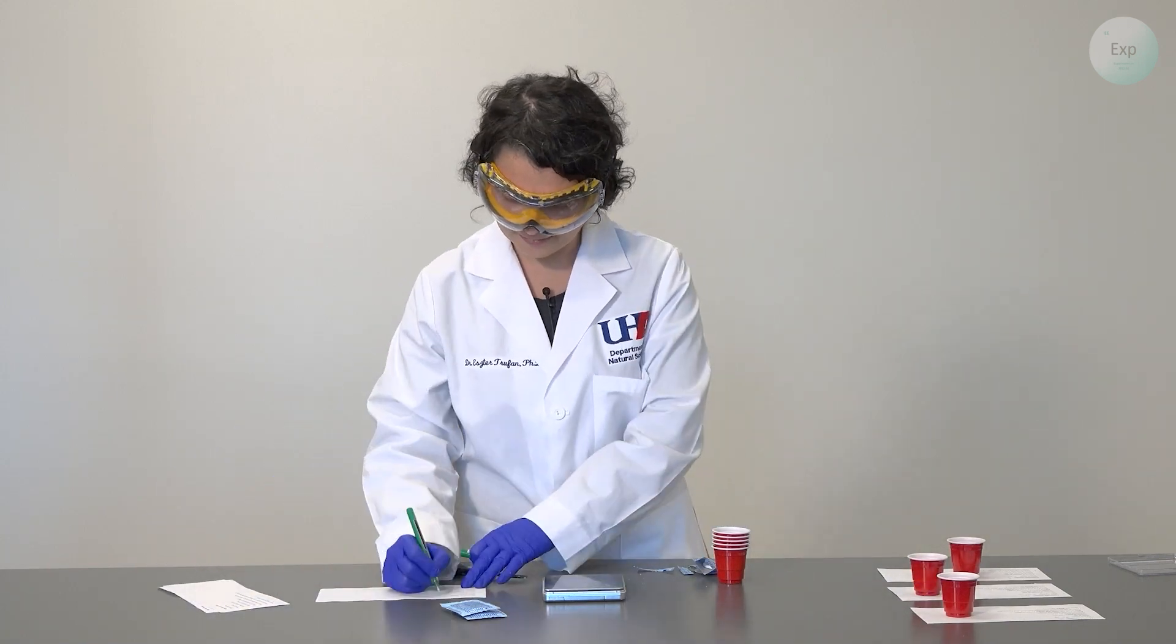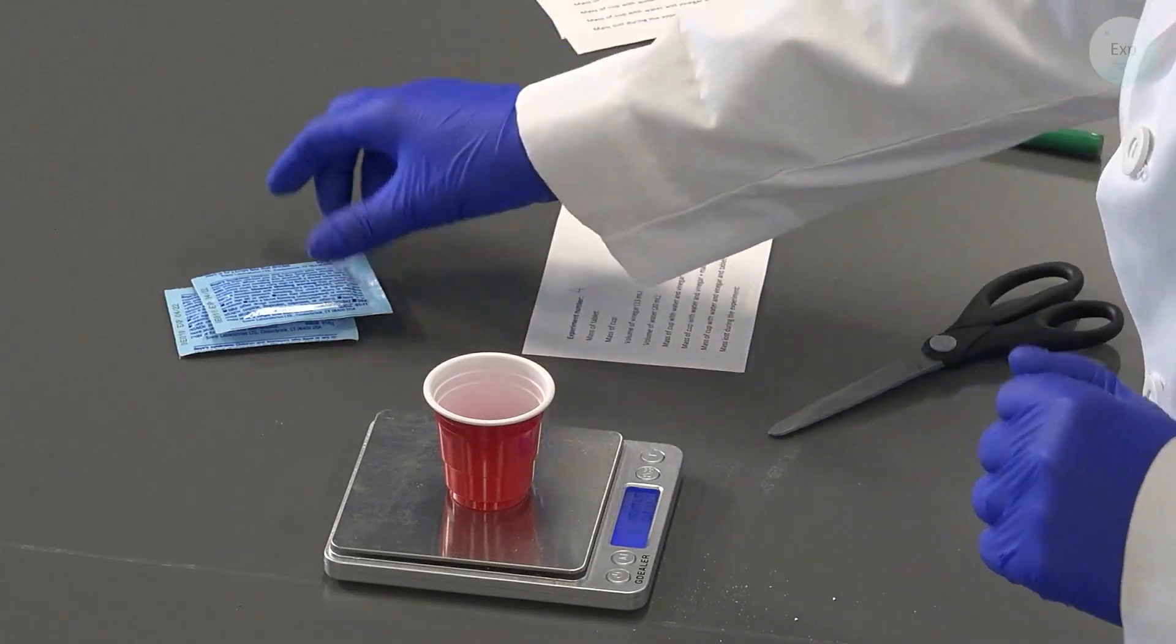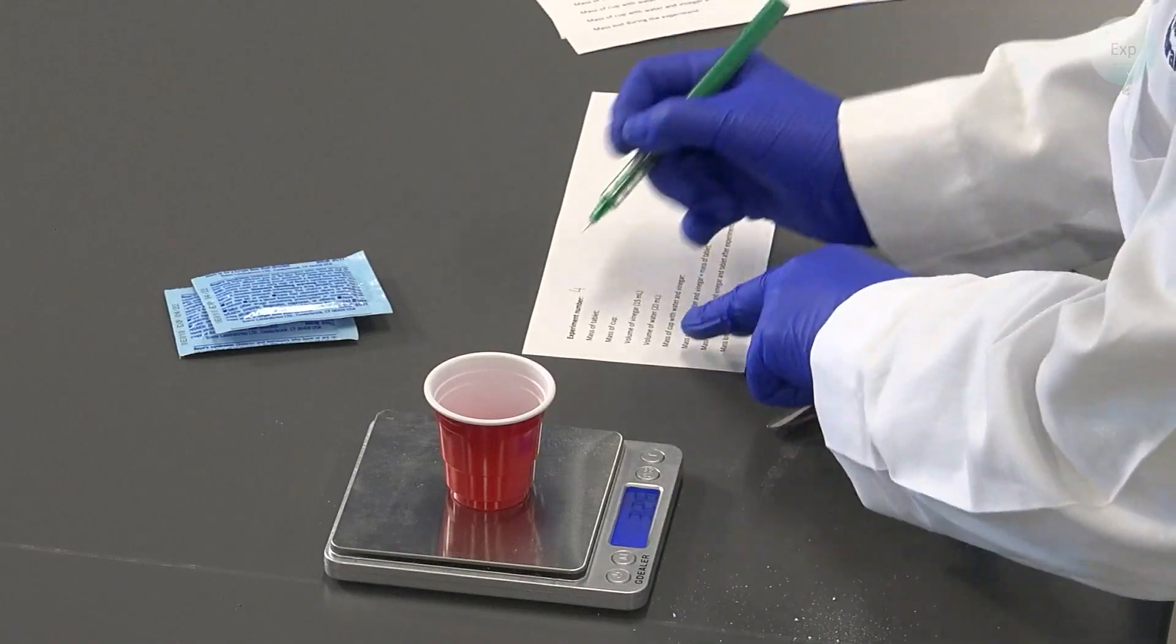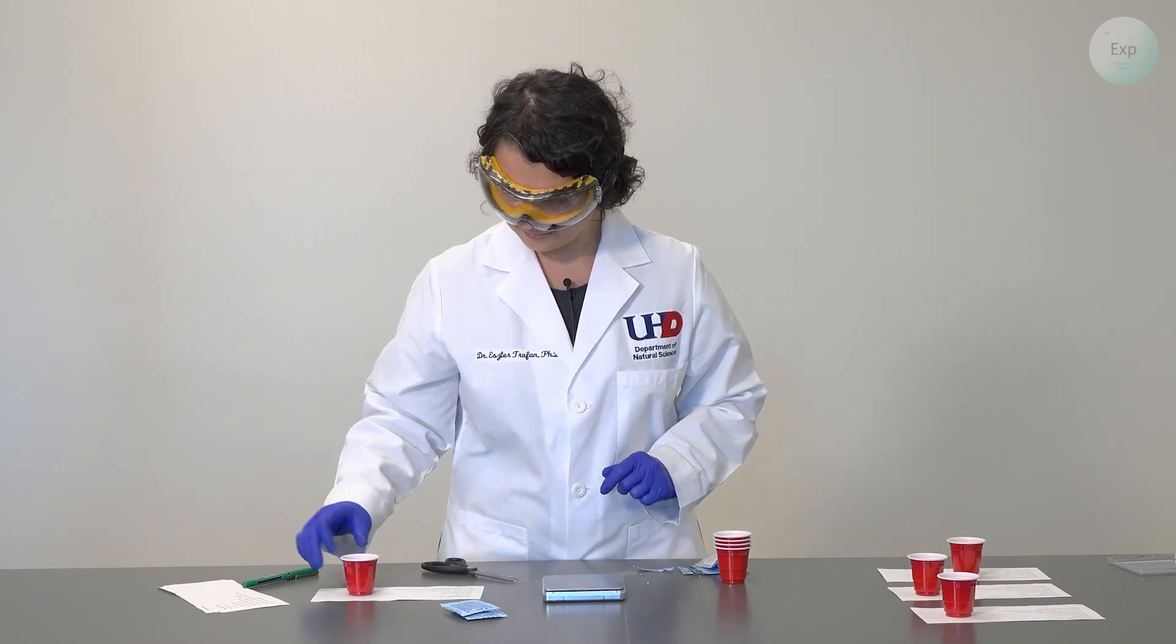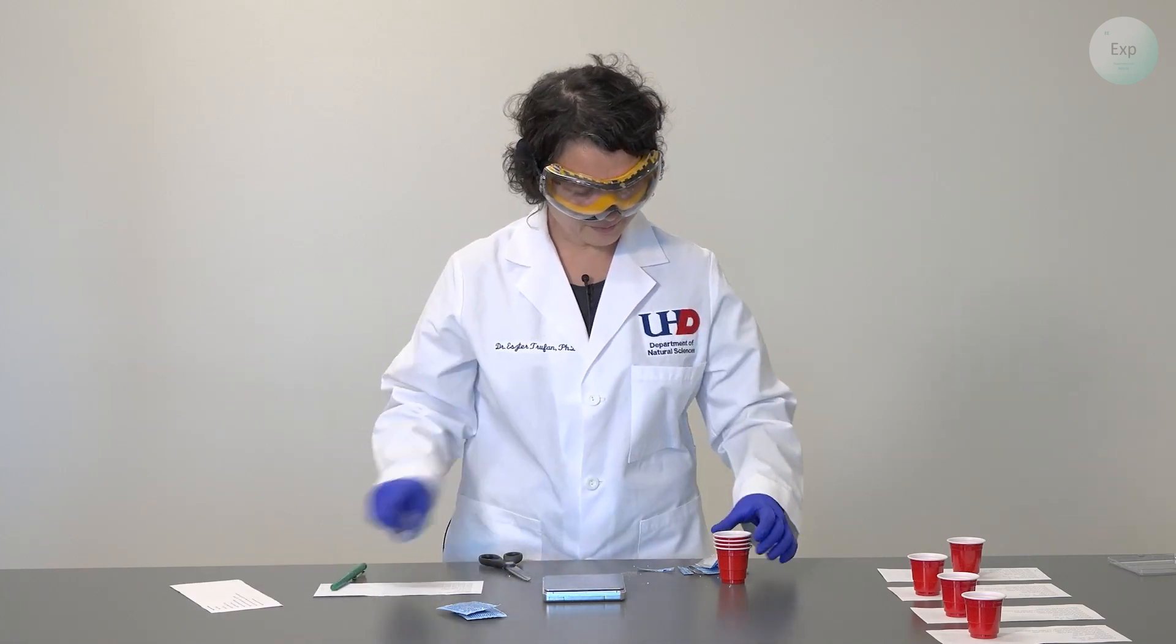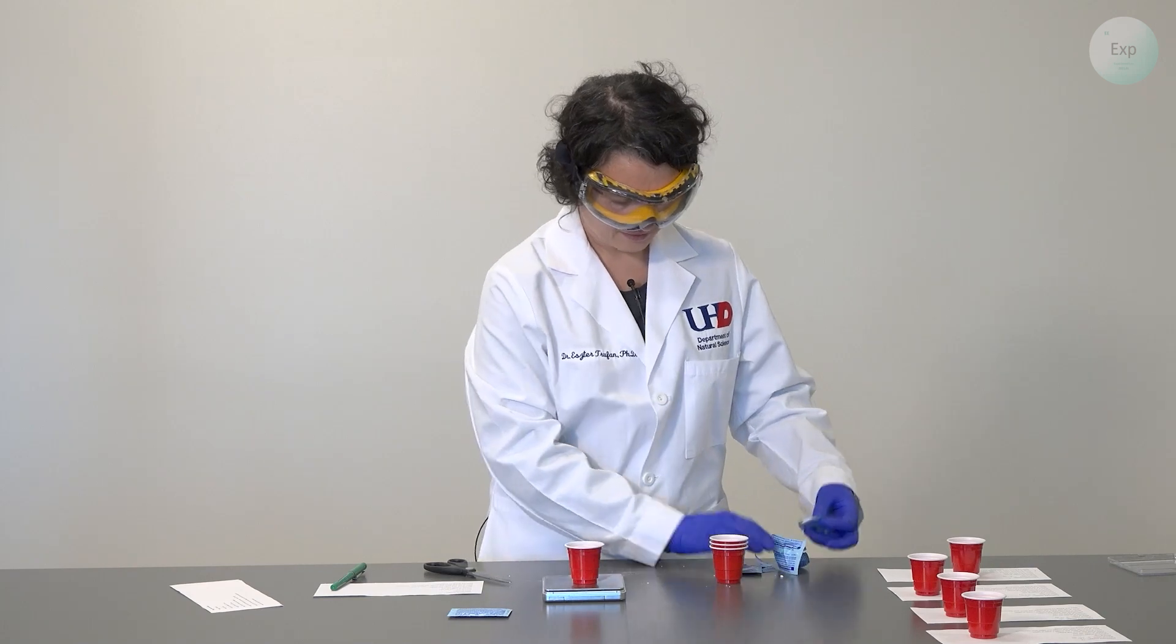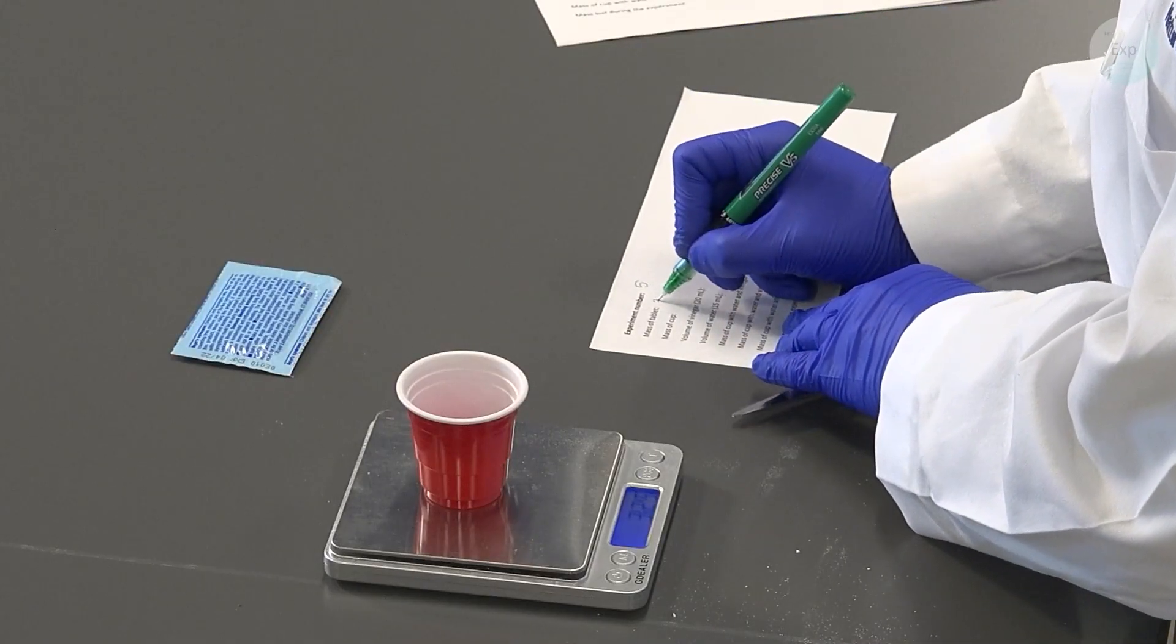For our fourth experiment we're going to do the same exact thing. Let's not forget to tare every time we place a cup on the scale. Our fourth tablet weighs 3.26 grams. For experiment five we bring up our cup, place it on the scale, make sure that it's tared, extract our next tablet and place it inside the cup. The mass of our tablet is 3.25 grams.